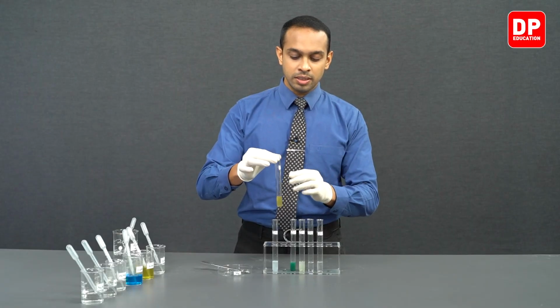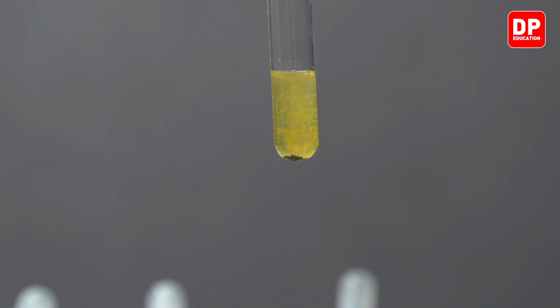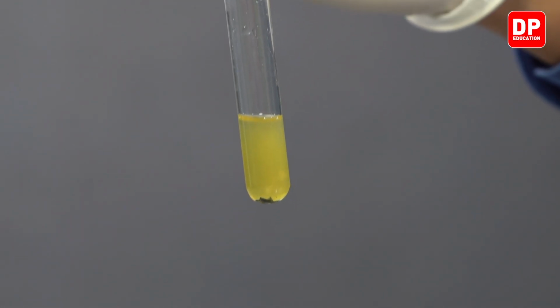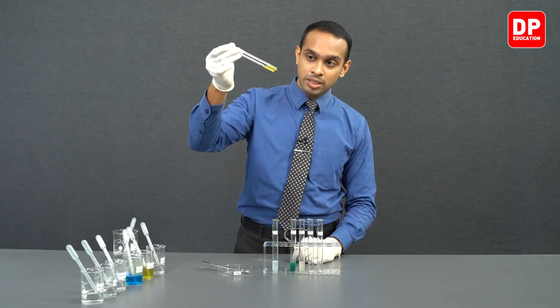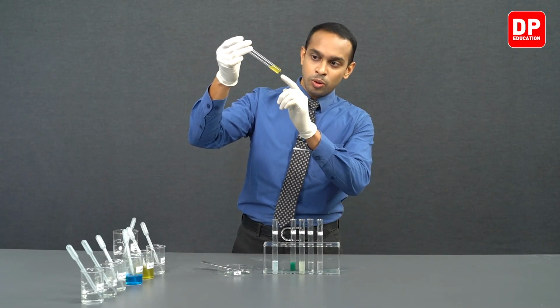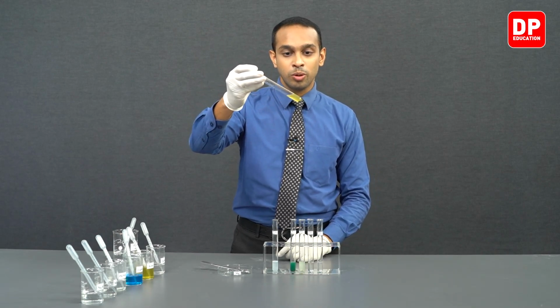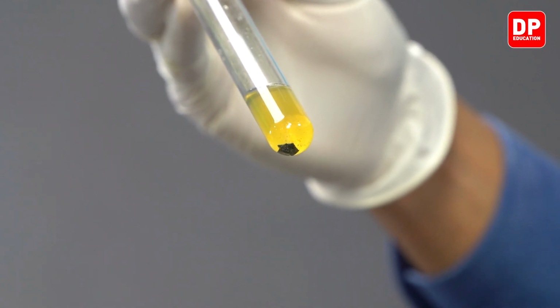Now we can move on to Fe2 plus aqueous ion solution. We can observe here Fe2 plus has shown a color change, and we can see a precipitate being formed as well. So this indicates magnesium has reacted with ferrous ions as well. At the bottom of the test tube, we can see small black color particles, but those are extremely small students. You might not be able to observe them in the camera.